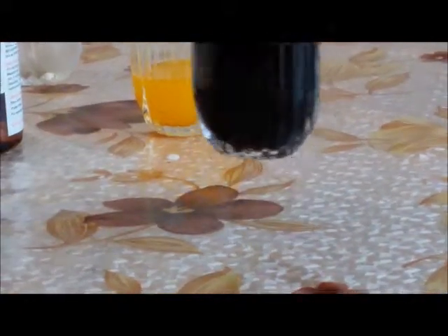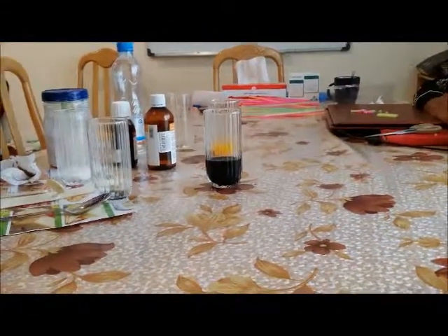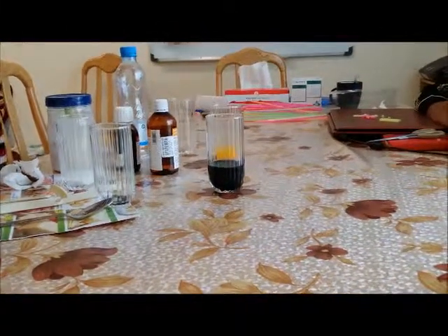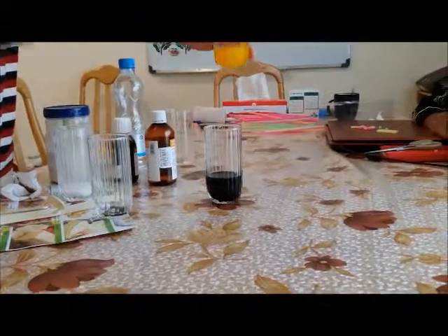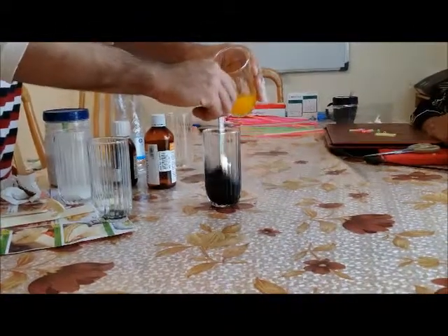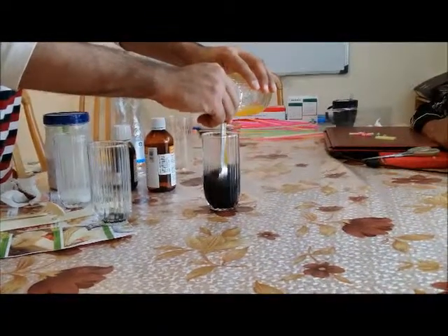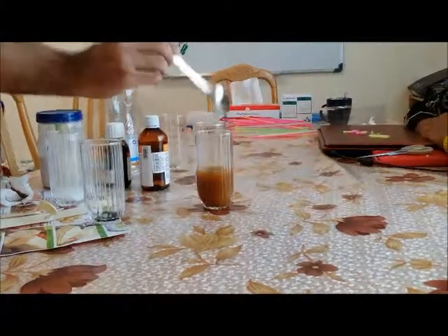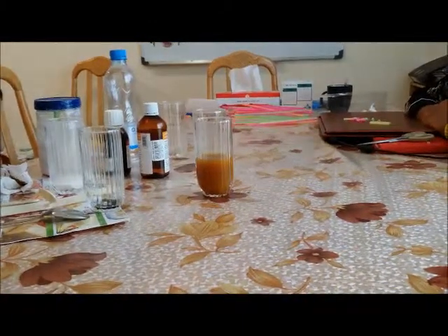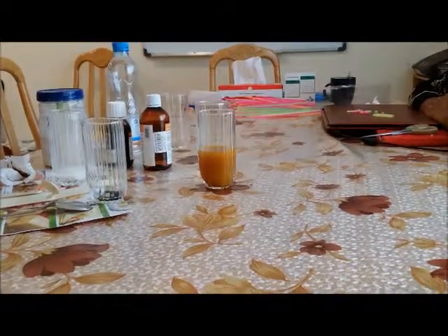There is something else that you can do. Turn it back into its color. How can you turn the blue-black back into its color? Just by adding more vitamin C into it. So I'll be using my stirrer now. Give a shake and add my vitamin C or ascorbic acid into it. And the solution tries to turn back into its color, but after some time, it will again turn into blue-black.